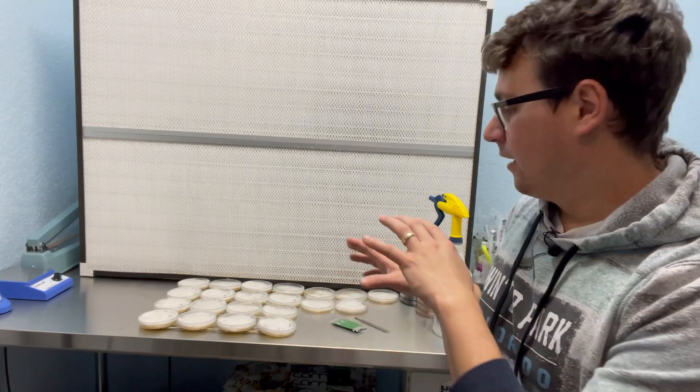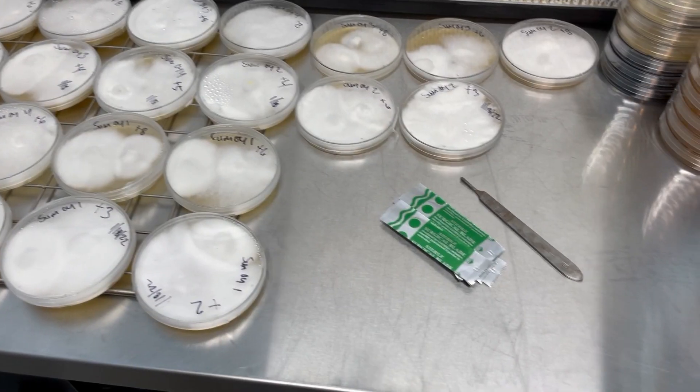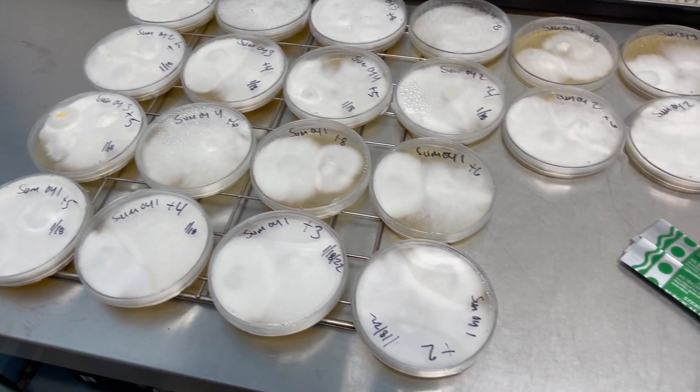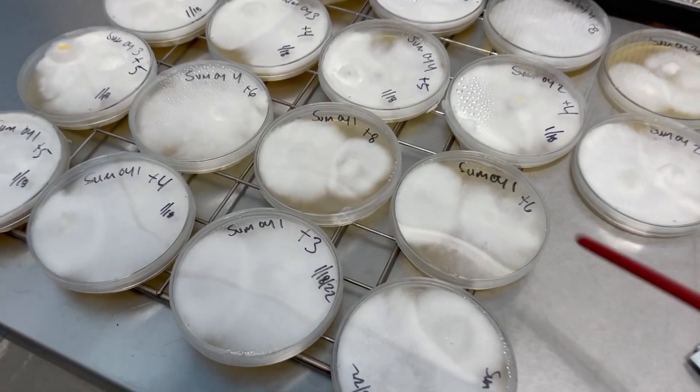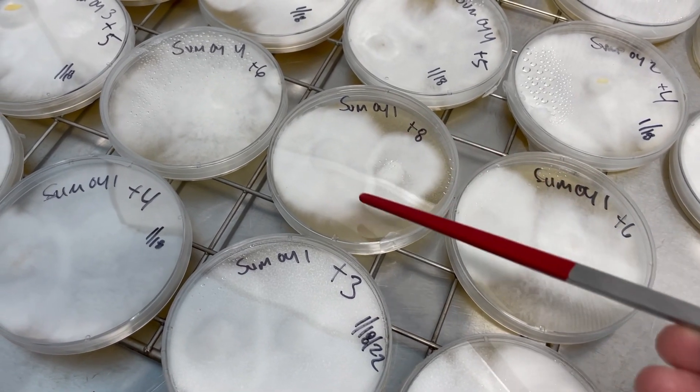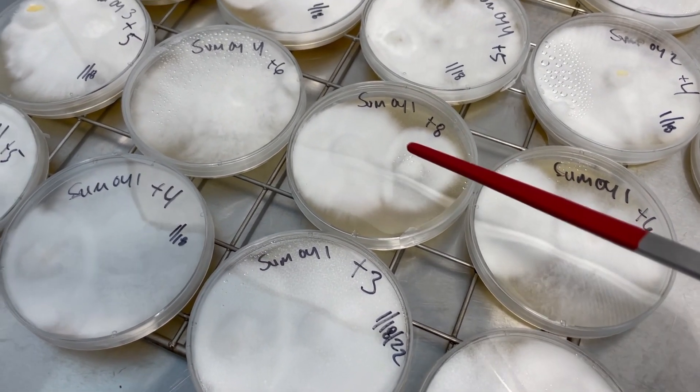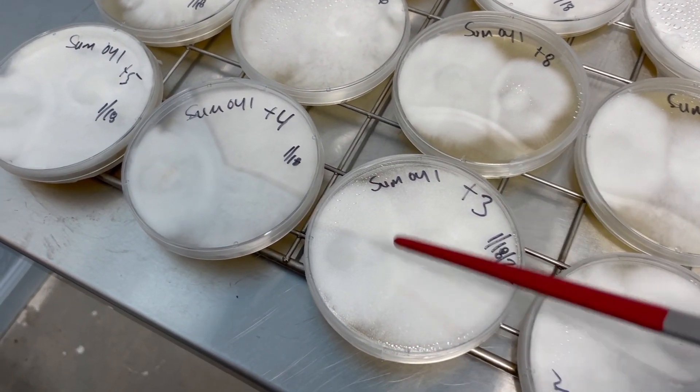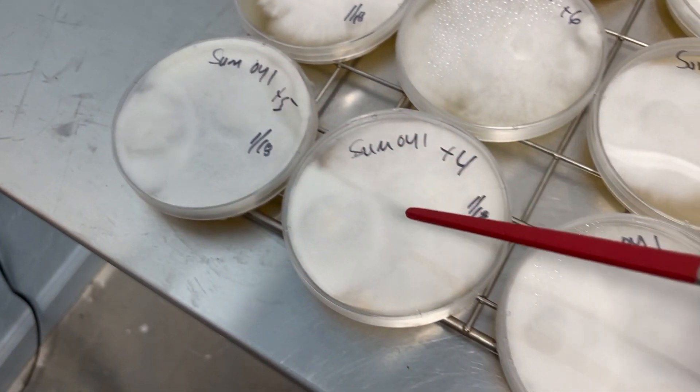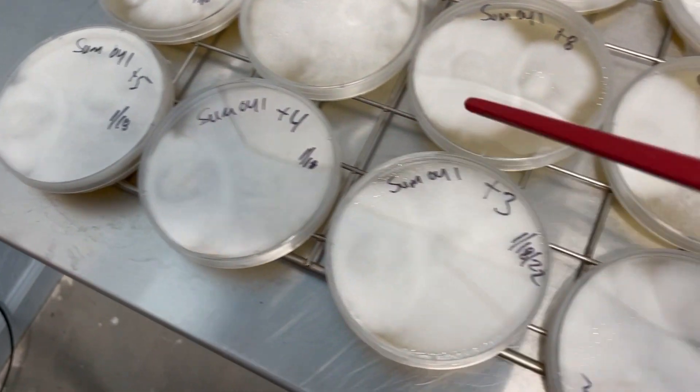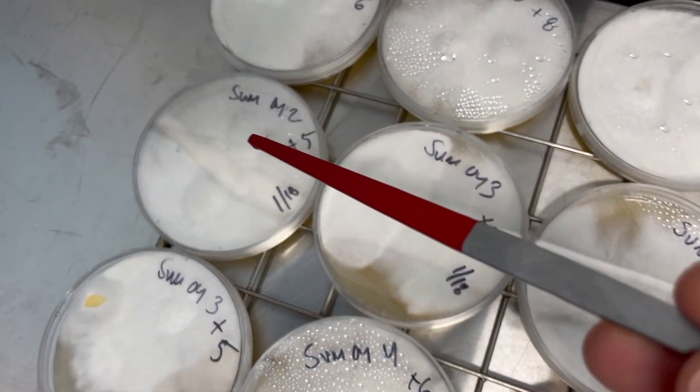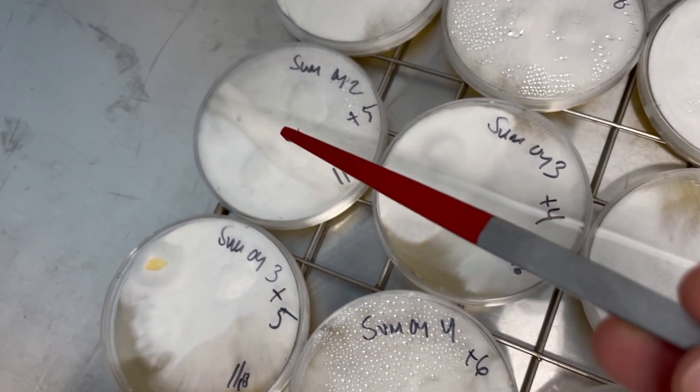I was hoping that they would cross with some blue oyster strains but it just never came to fruition this year, so I'll be going back and back crossing more strains in the future. But this one looks really promising. Okay guys, so these are the oyster mushroom pairings from our breeding project and I just want to point out the super obvious pairings like this one and eight right here. You can see this really thick band and that's a good sign that they have exchanged genetic material. You can see one in three, one in four, one in five. So it seems like one was kind of a slower grower but it was very compatible with all these different phenotypes.